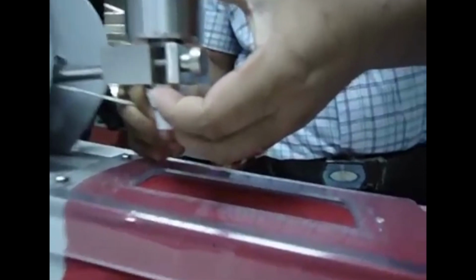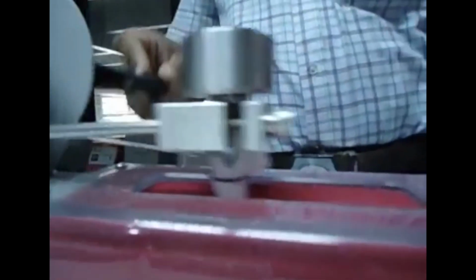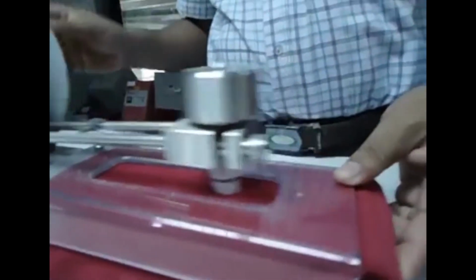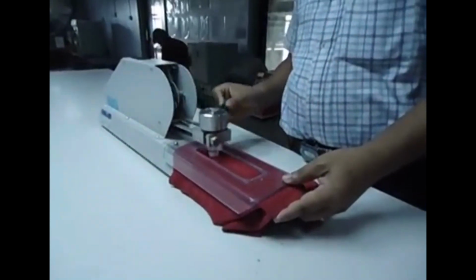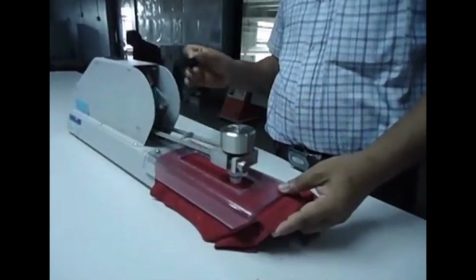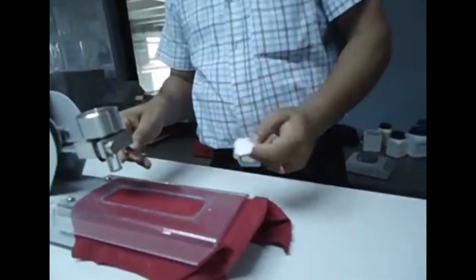It is abraded using a white, undyed fabric. This undyed fabric is held in the finger, that is the extension on the top side of the crockmeter, and the colored material is rubbed using this white fabric, with 10 turns at the rate of 1 turn per second. The color change on the test specimen and staining on the white fabric are then assessed.